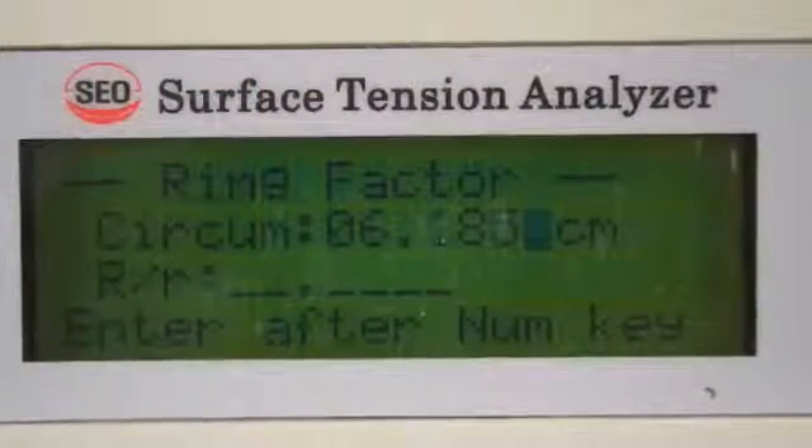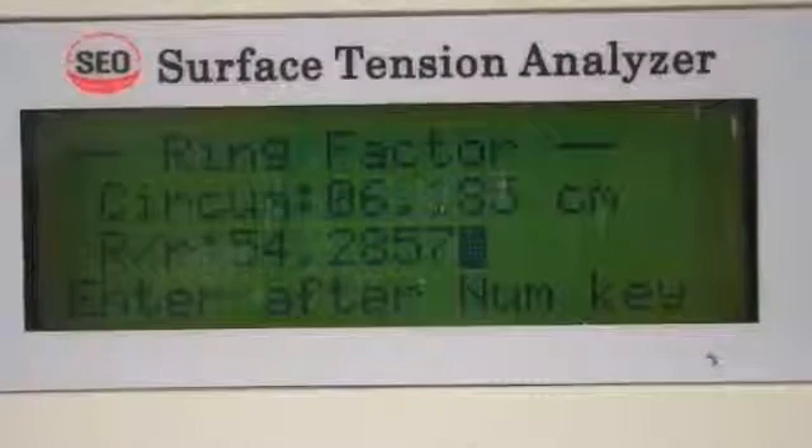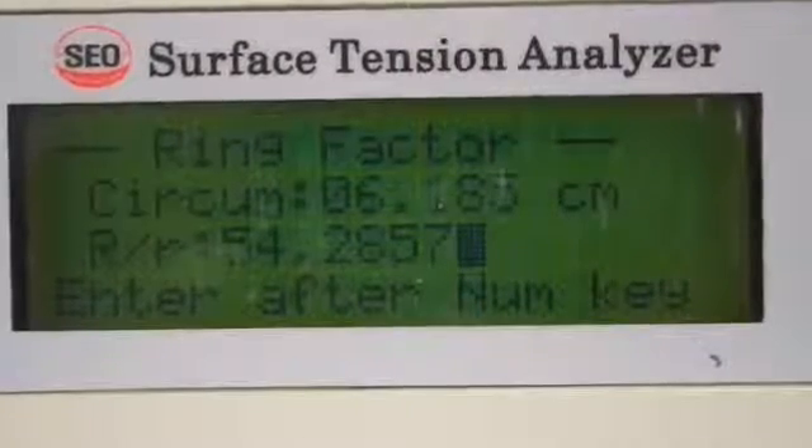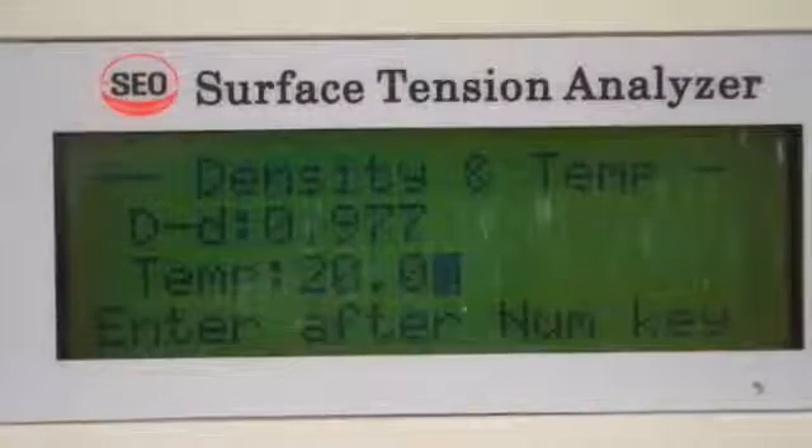Simply enter the circumference and press ENTER. Next, enter the R-factor and press ENTER. Next, depending on the liquid surface being tested, enter the density and press ENTER. Enter the temperature in Celsius and press ENTER.